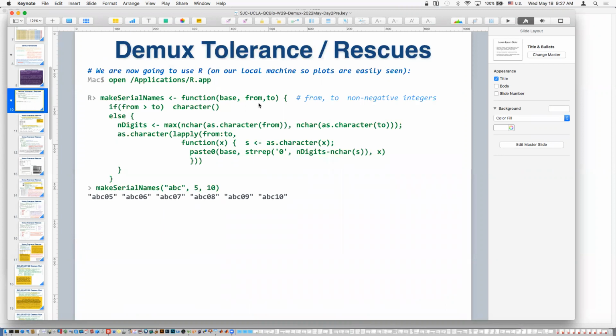Okay. So that's the framework that this mismatch tolerance stuff exists in. But now we want to make intelligent decisions about whether zero mismatch is sufficient. Because Demux is always a battle between recovery and mis-Demux, and recovery is generally easy to measure, that's the one we generally concentrate on in making a decision.